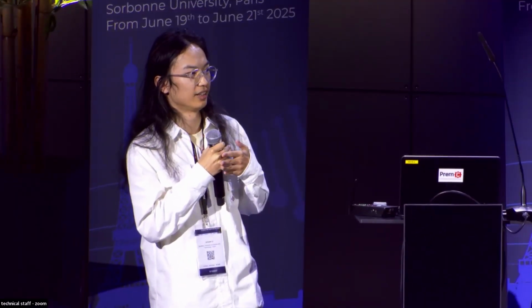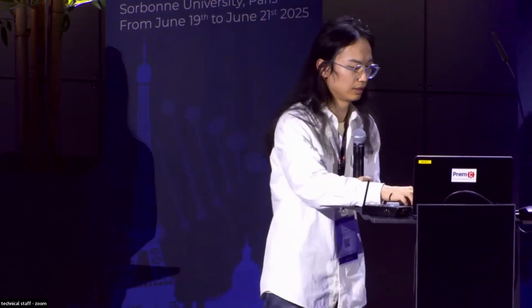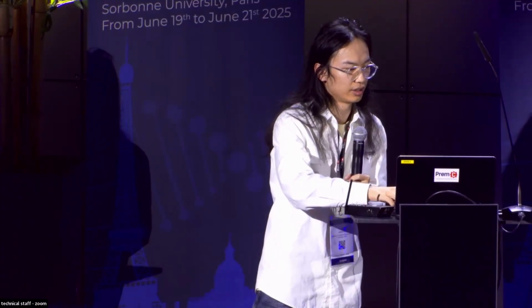We designed SUSTag because we think the tag system provided by ONT is not suited for our pipeline because it's too short. As I presented here, the model input window is fixed and the sequencing speed is fast.